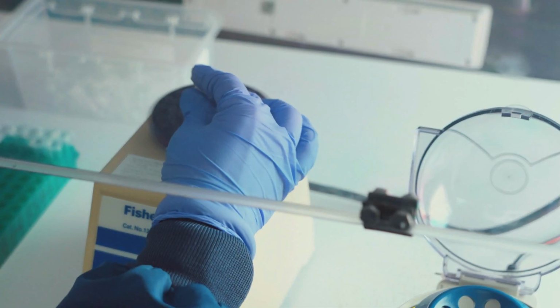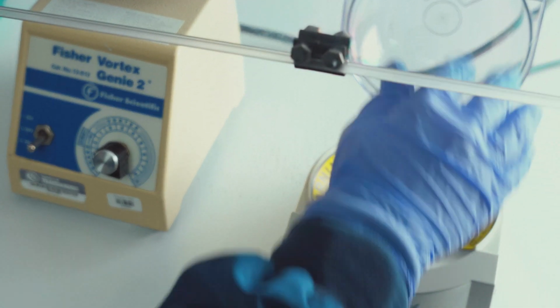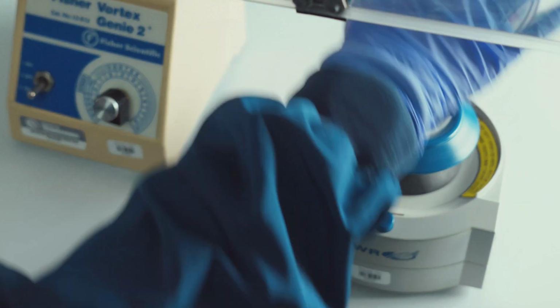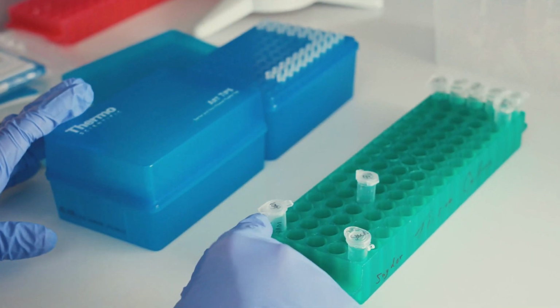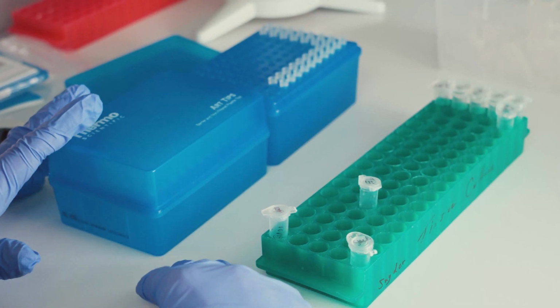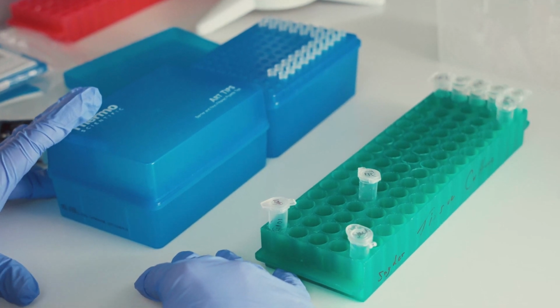Next, what you're going to do is vortex and centrifuge your sample, followed by nanodropping your sample to ensure that it is the 10 nanogram per microliter working concentration. Once that has been obtained for all of your specimens, you then are ready to proceed forward with plating.